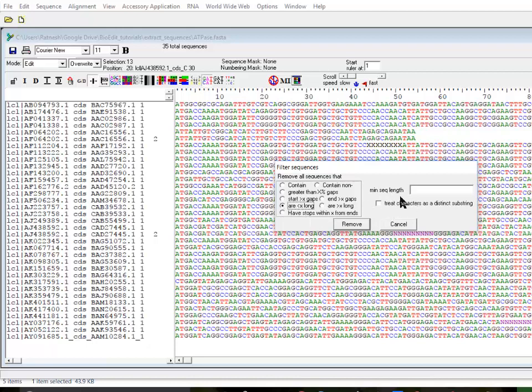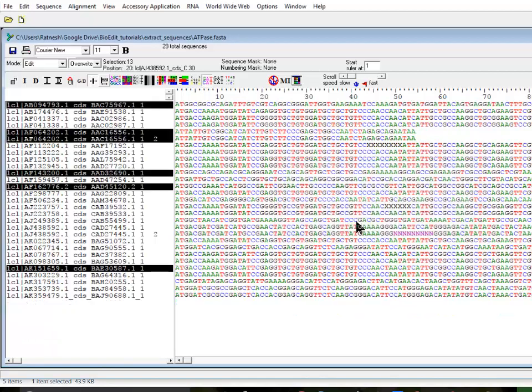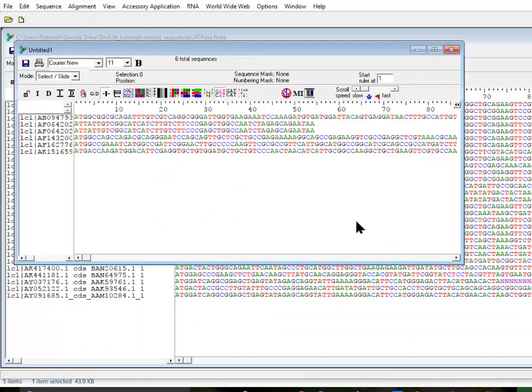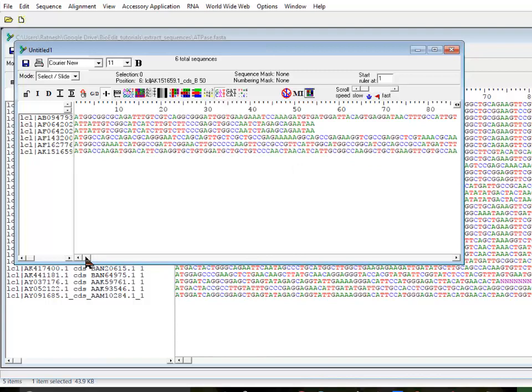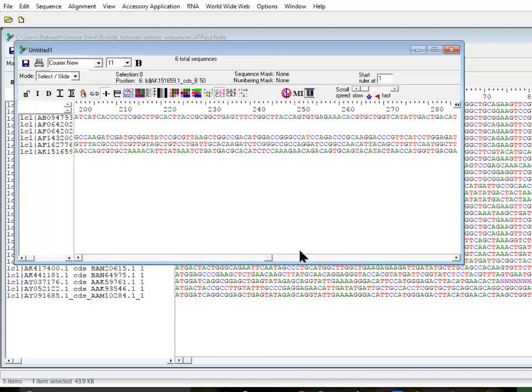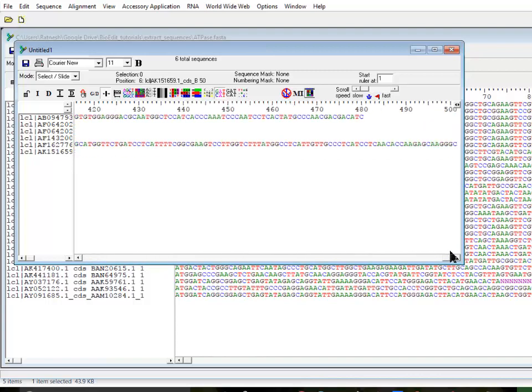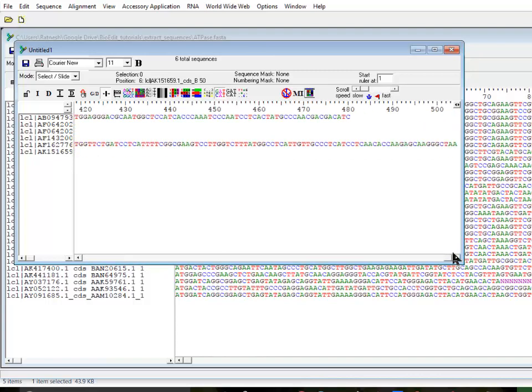For example, if I say I want all the sequences which are larger than, for example I see 1000 bases, I don't know how many I have but let's try. If I do it, it is going to remove everything which is less than 1000 bases and only leave the sequences which are 1000 bases.